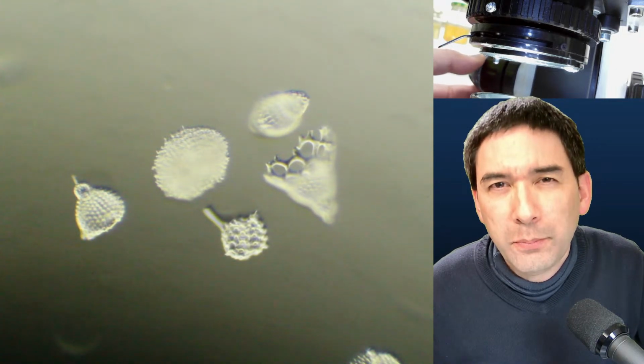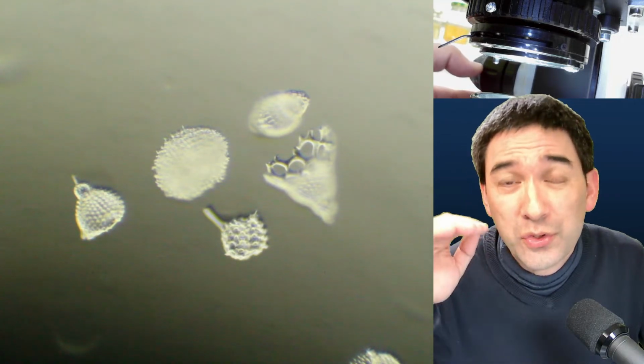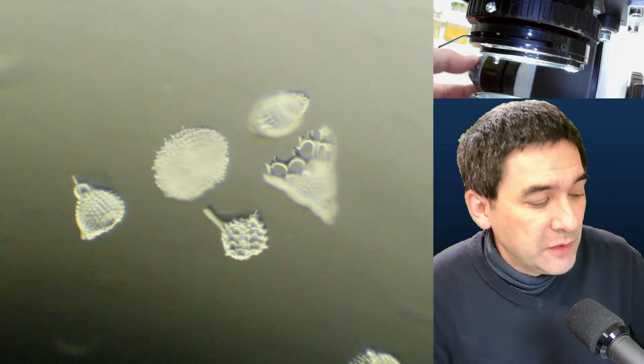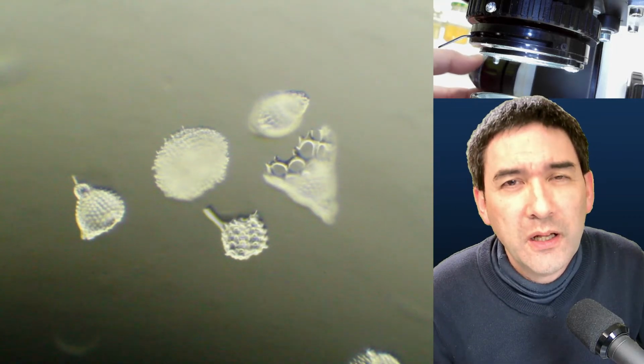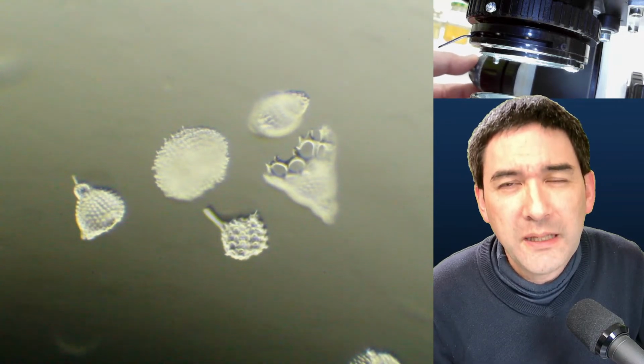Normally you always put the filter directly into the filter holder close to the iris diaphragm. If you put it directly on the lamp, then I don't know if this is always going to work, because it's actually quite important that it's placed in the correct position.